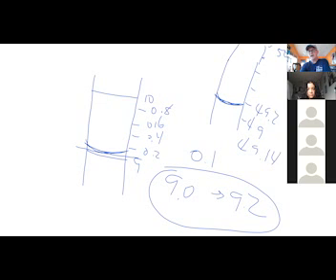Because I know it's more than 49.1 because it's more than halfway. And so this is a real estimate. My high and low estimate might be relatively smaller on the 50 mL than on the 10, just because the tick marks are further apart in the 50.